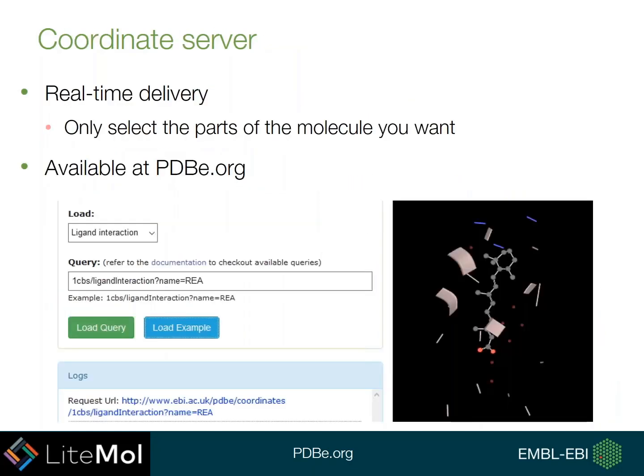The coordinate server is something else that has been developed alongside LiteMol, and this is another added improvement on LiteMol to add real-time delivery to what you're seeing. So it only takes the bits of the molecule that you want to look at and displays them for you. And if you want to find out more about how you could use the coordinate server, for instance, at looking at ligand binding sites, you can see this at pdbe.org.